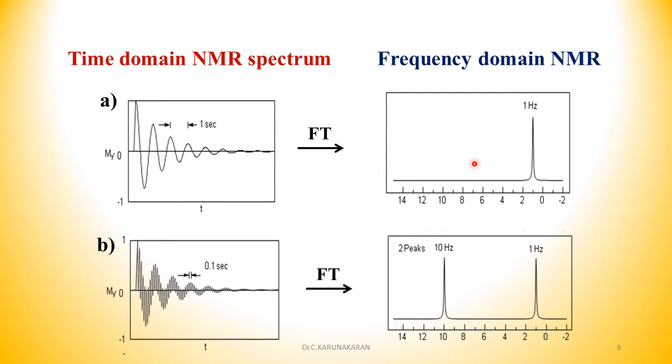However, on Fourier transformation, a mathematical process, even our eye does Fourier transformation to give the image we can see. This is fundamental mathematics. We don't know, but our eyes are doing this, even for the uneducated. On Fourier transformation of the FID signal, here you will get one signal because you have only one proton in the compound.